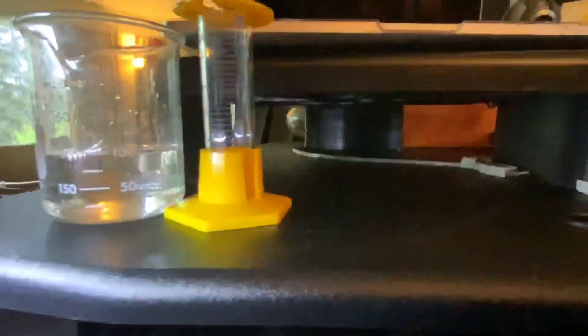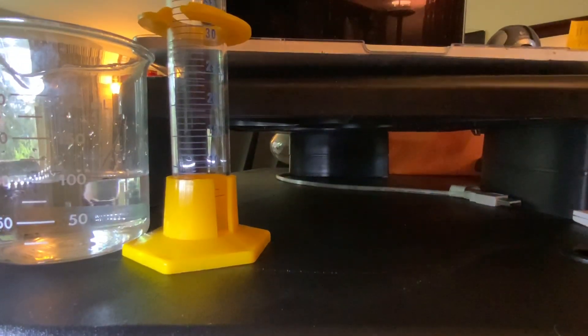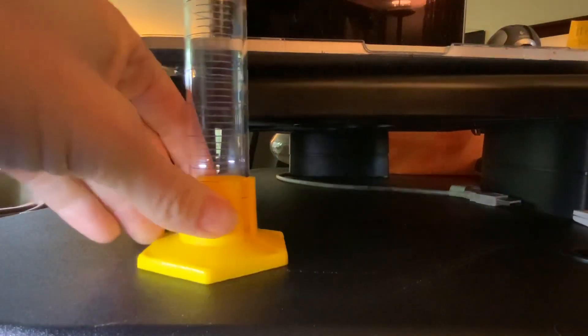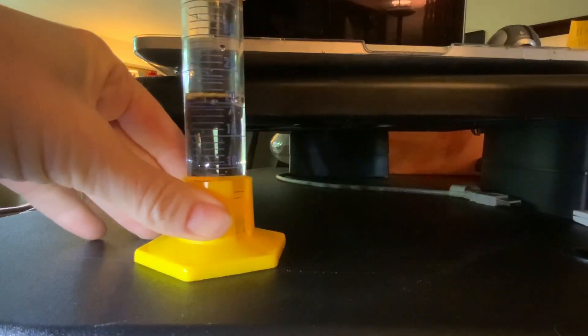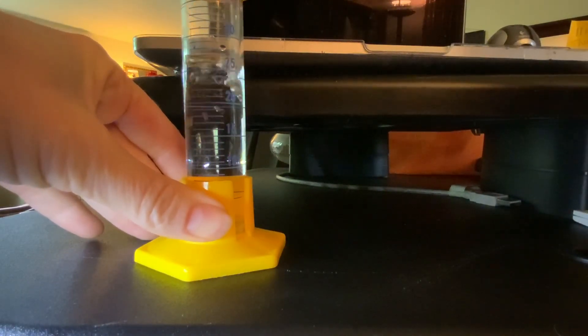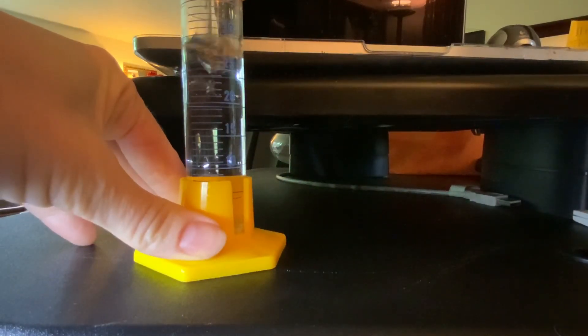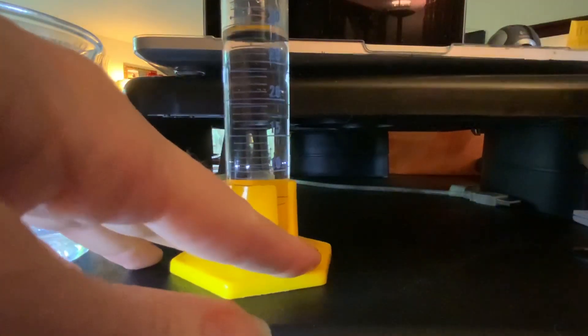Now I'm going to use my 50 milliliter cylinder and add some water to it. Doesn't have to be exactly 30 but some amount that we'll write down precisely. Get rid of a couple of those air bubbles there.